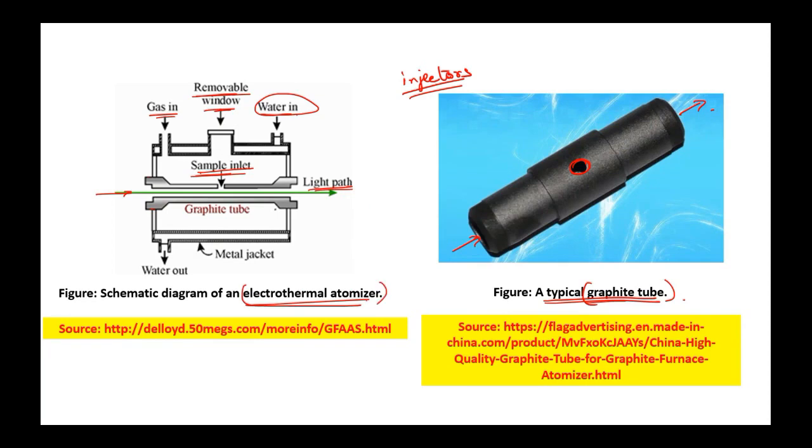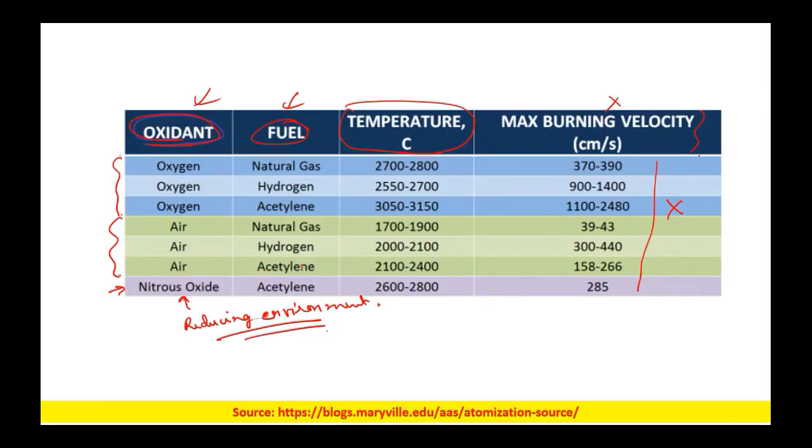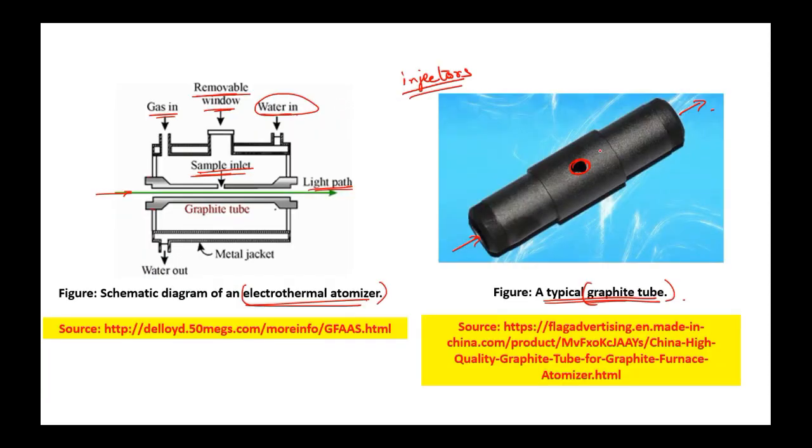The main advantage over here is that you do not need other kinds of oxidants or fuels. So this can handle both liquid and solid samples.